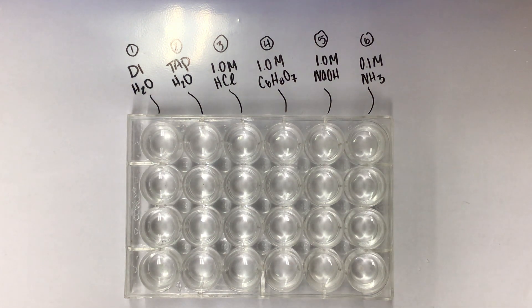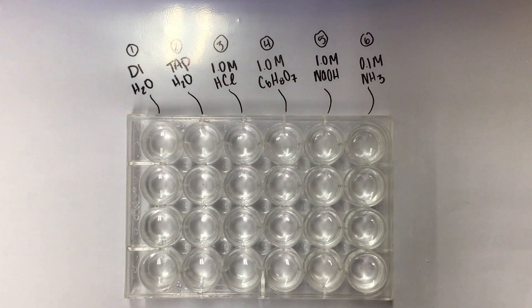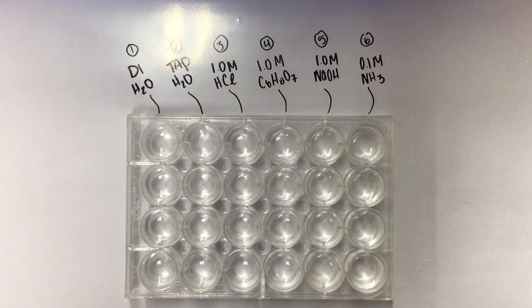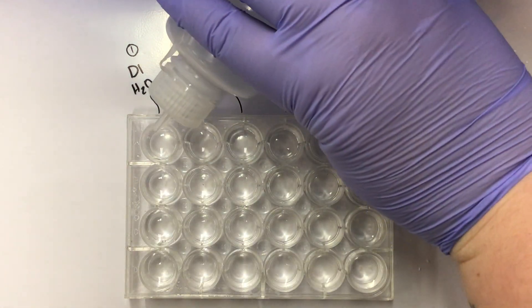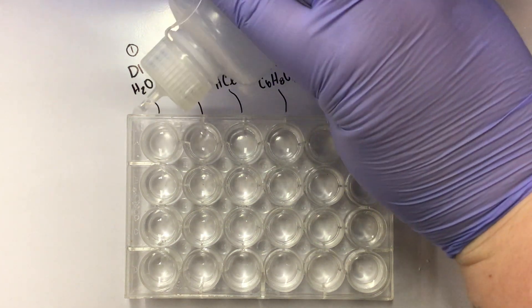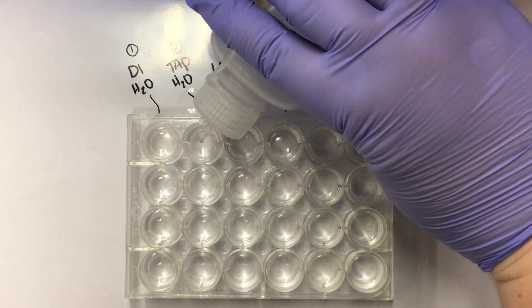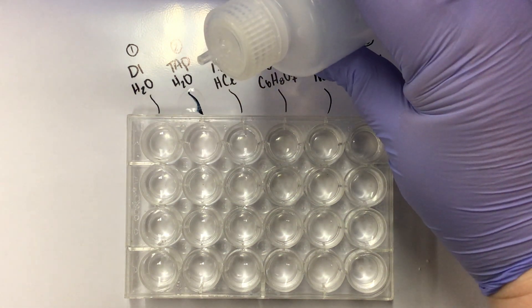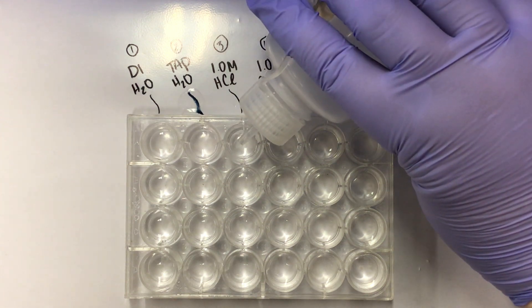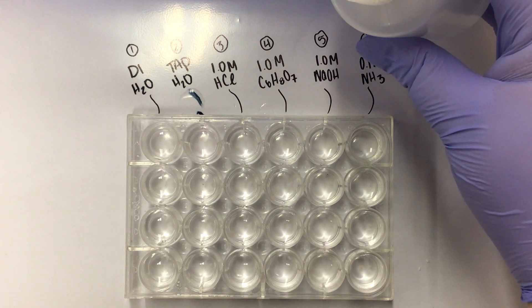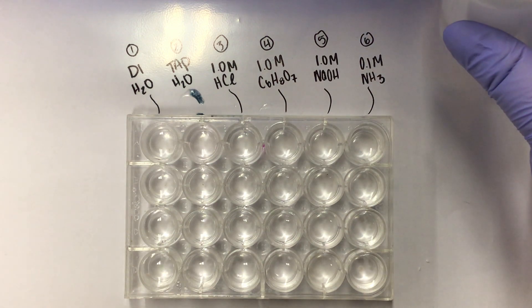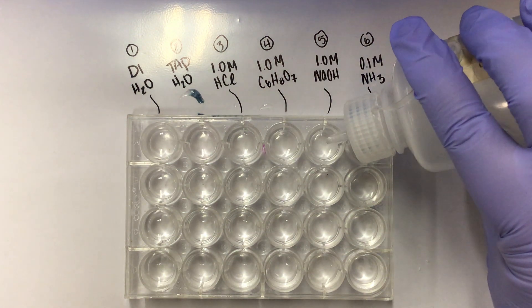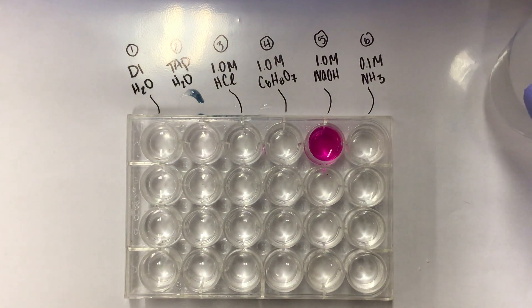Now we are moving on to the phenolphthalein indicator test. Here's our phenolphthalein indicator, clear and colorless to start out. I'm going to put just a couple drops in each of these first wells. There's our DI, our tap, HCl, C6H8O7, NaOH, and NH3.